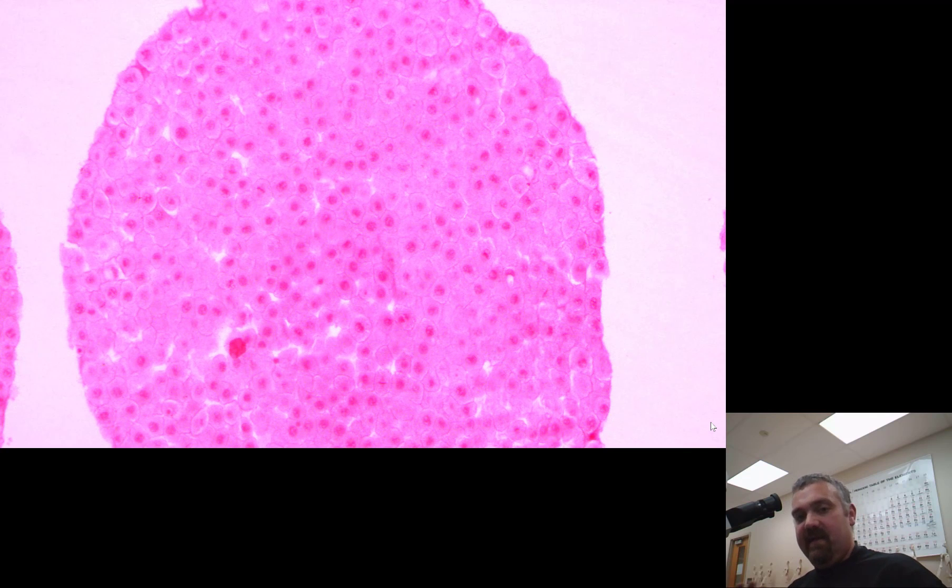Here's low power. I'm going to look through the actual microscope itself and then check the screen. Looks pretty good. Even from this magnification, we can see different cells in different steps of mitosis. What you're looking at is a huge pile of cells. This is not just one really big one.